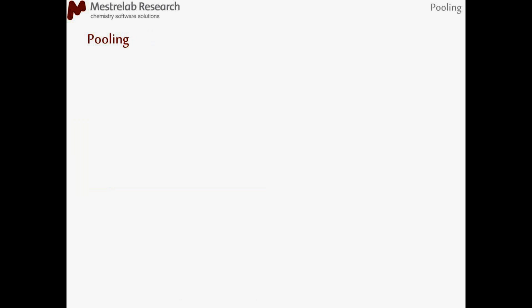So starting now, getting our hands more into the matter, one of the first questions when you are starting or thinking about designing a campaign is always the creation of the pools, the creation of the mixtures. There are many papers out there.